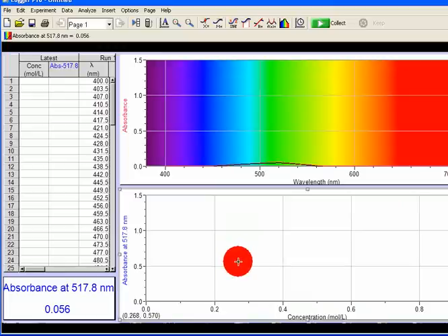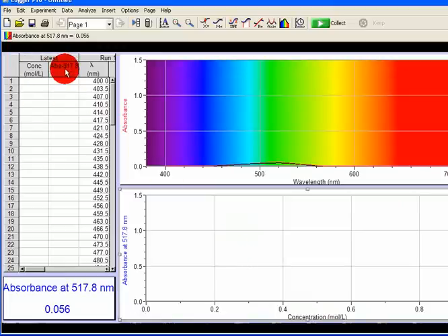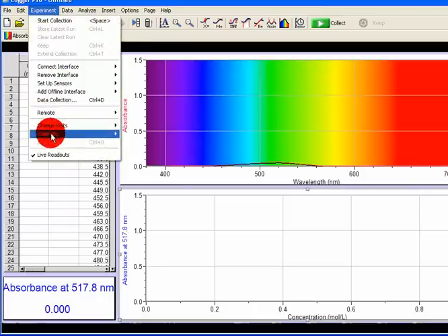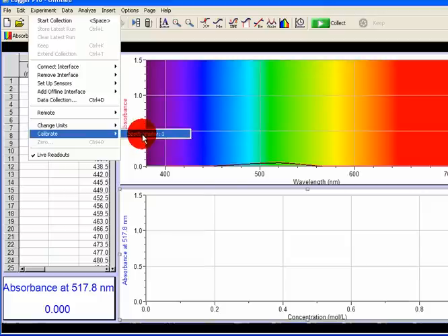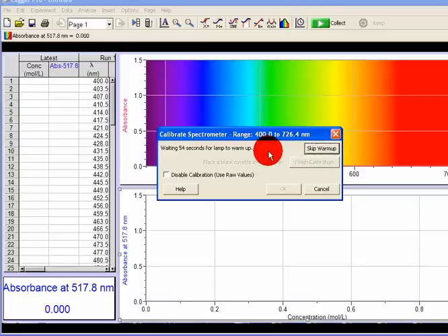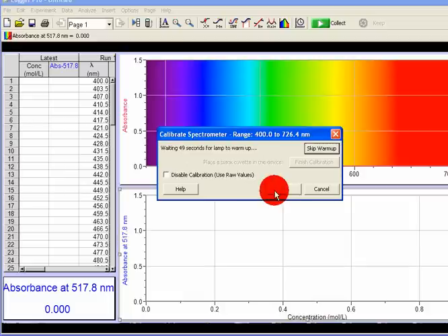So I have concentration against absorbance. Next, I'm going to use a blank — put in a blank to calibrate this spectrophotometer. Get into Experiment, Calibrate, Calibrate Spectrophotometer. Calibrating it right now. It needs 60 seconds to warm up, so I'm going to leave it for 60 seconds. Once 60 seconds is up, I'll click on OK.